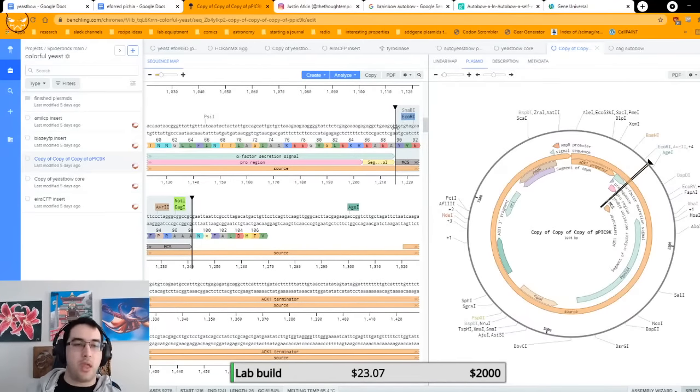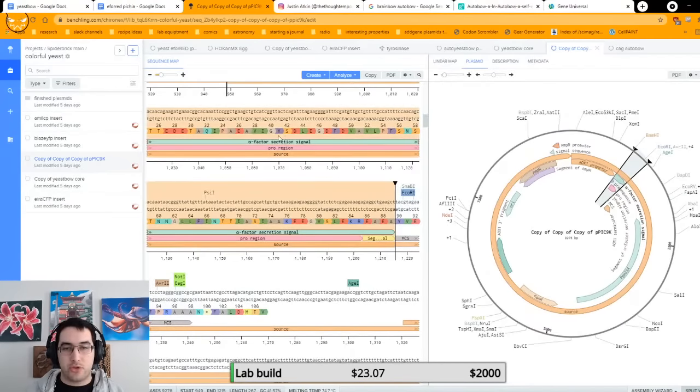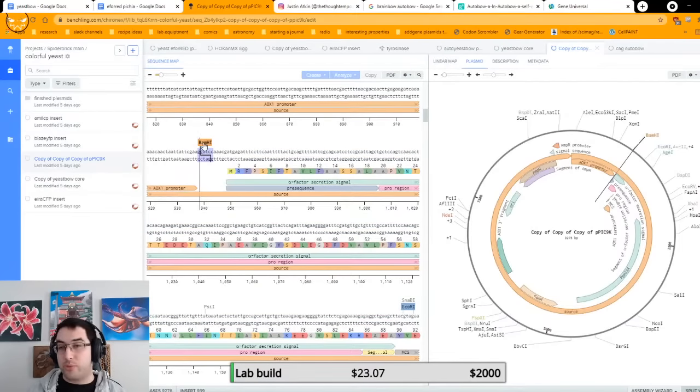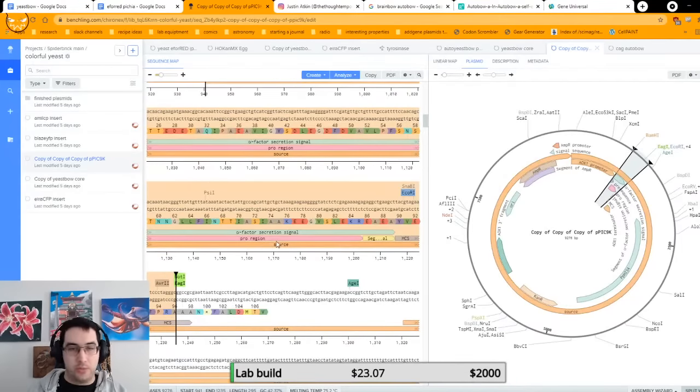Specifically so that it's very easy to pop the thing open, shove in the thing that you want, and call it a day. So what I did was I said, okay, this is lovely and all, but one of the perks of this particular plasmid is it has this chunk in it, which you'll see as alpha factor secretion signal. Basically, this tells whatever protein is stuck to this, get out of the cell. So basically it makes the cell poop it out, essentially. This is really, really helpful if you want your product to not be inside of the yeast at the end of all of this, but in this case, we don't want that. So instead of using the multiple cloning site or one of the enzymes that's in here, I scrolled up past that, grabbed this restriction site, and said, I want to use this one. So I'm going to use BamHI and NotI, which means it's going to cut all of this out. It's gone. We don't need it.